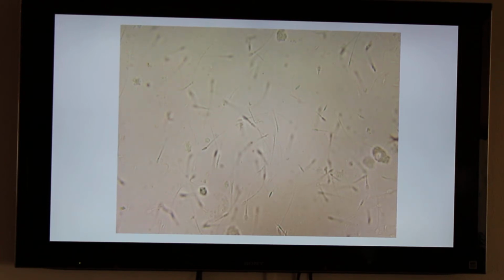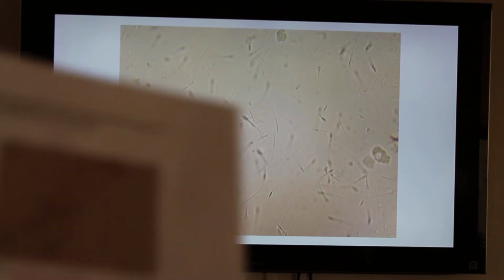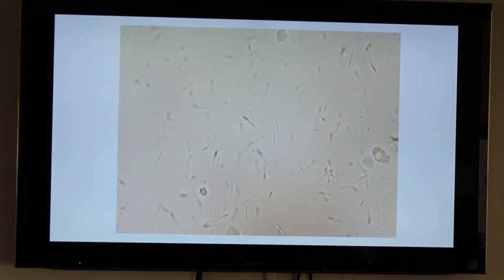I skipped number 7, sorry about that, but oh, you can't really see it. Well, anyways, that one was your amorphous phosphates or amorphous debris. Usually you find it in alkaline urine. Possible if you're seeing fragments of crystals like that, we want to think about our centrifuge speed and make sure we're not spinning it too fast. This picture is sperm. It is common and likely to find sperm in an intact male.